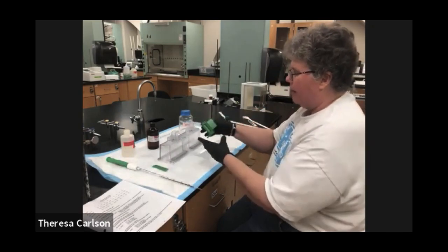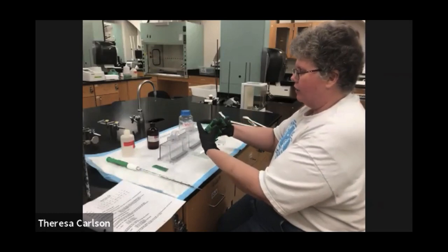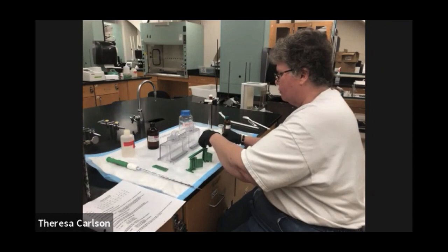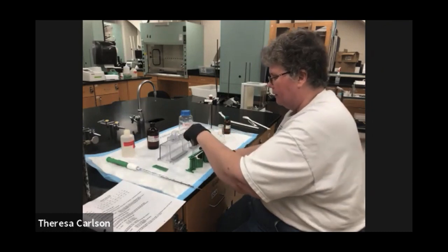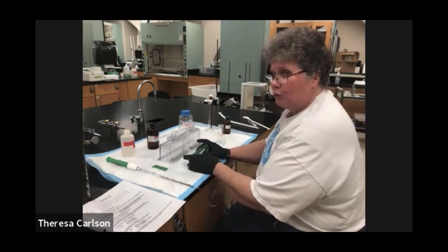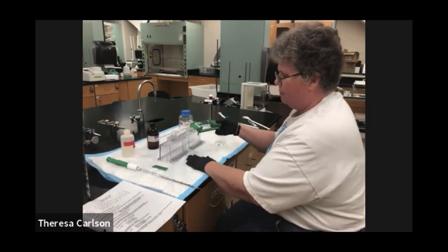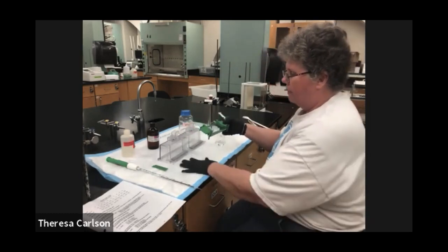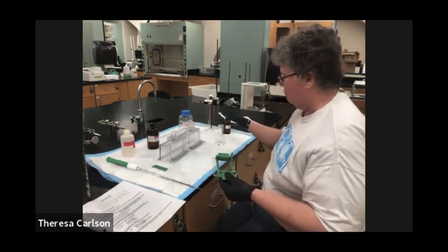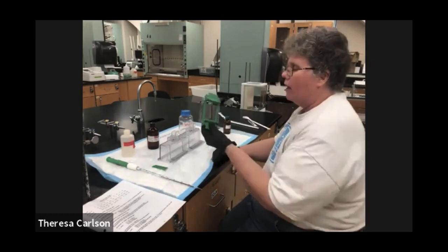Then, to get the plates into a proper position, you want to put them into the clamp assembly. The clamp assembly has feet on the bottom. It has these little gates that close right there. You're going to slide your two plates together, shorter plate towards you, into the gate. You are using a benchtop cover because if you spill acrylamide, you don't want any of it getting onto the bench.